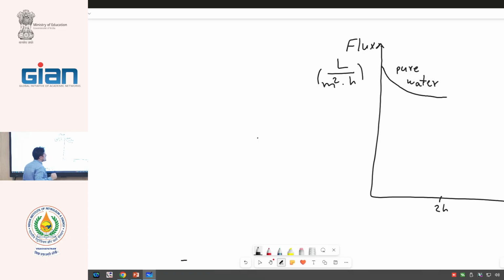Okay. In the second step, we replace the pure water with a foulant agent. The foulant agent can be oil, or our wastewater. We have an industrial wastewater and replace our pure water, distilled water, with our wastewater.